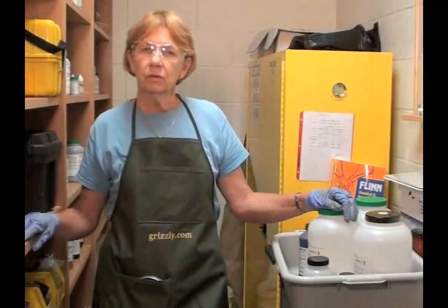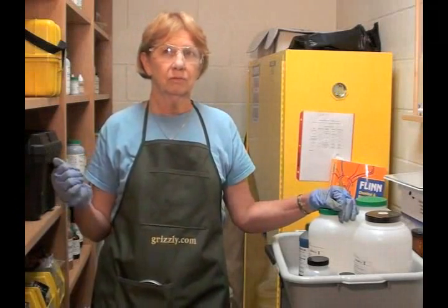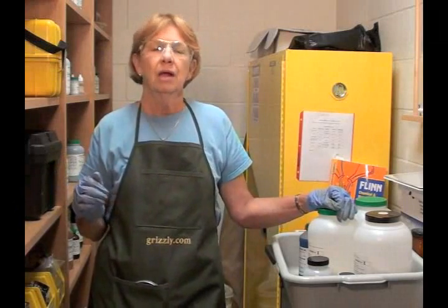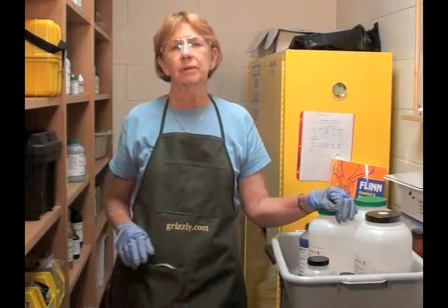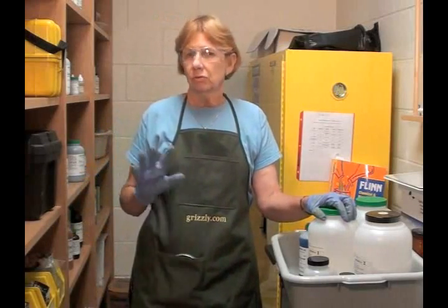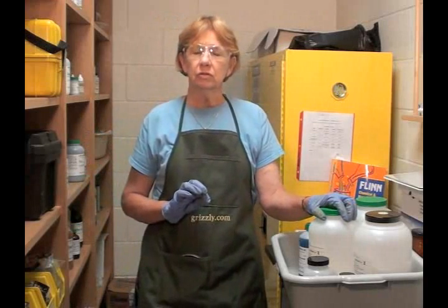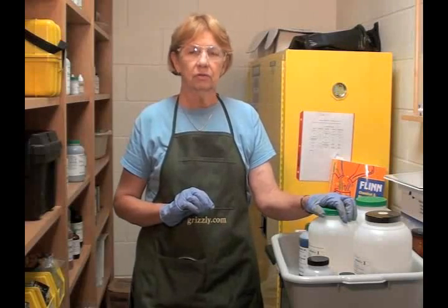After you've done your inventory, you might have realized that perhaps you don't need 15 pounds of potassium hydroxide and you want to dispose of 10 pounds of it. And you found other chemicals that you just have too much of or you don't use them anymore and you want to do away with them. So what can you do? First thing you need to do is determine what your status as a hazardous waste generator is.